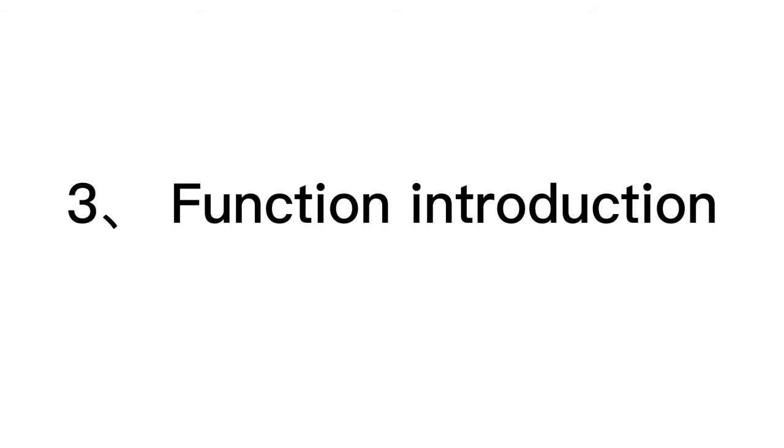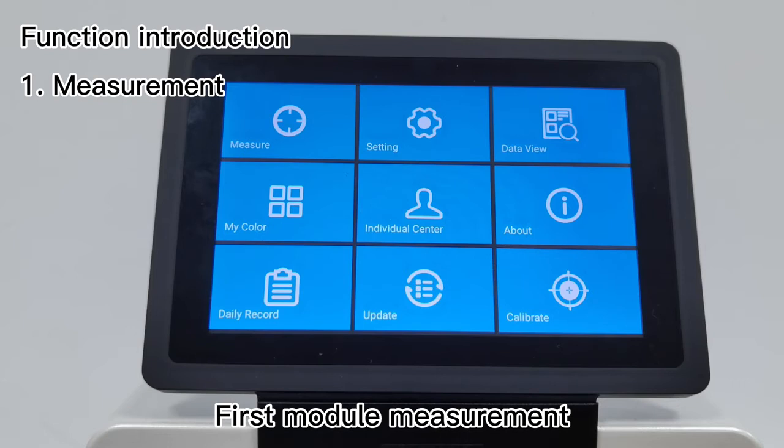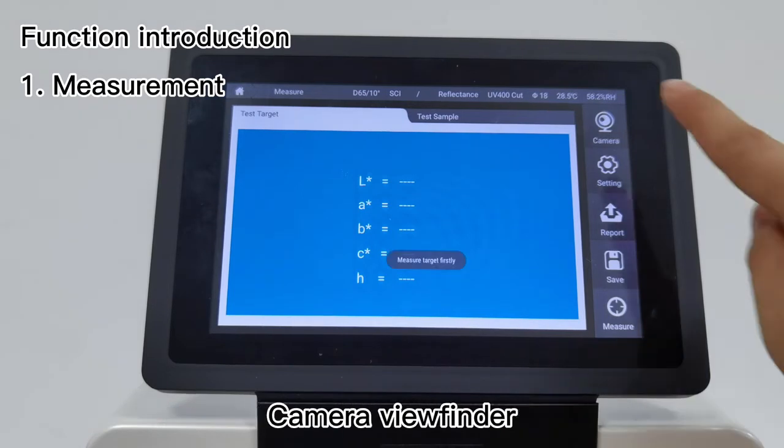Function Introduction: The instrument has 9 functional modules. First module is Measurement - all color measurements are operated in this module with camera view finder.